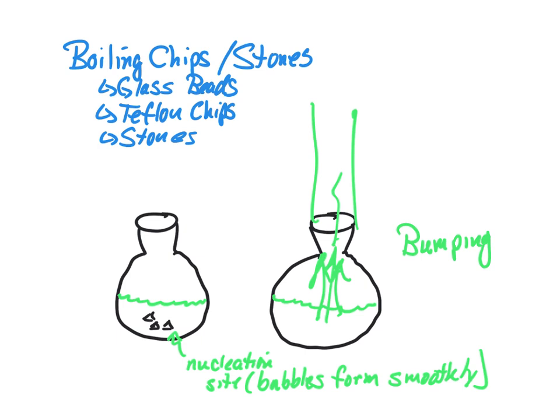Because what happens is these very pure liquids, especially non-polar liquids, can do something called superheating. That is, they can heat above their boiling point temperature without boiling. But then when they do boil, the whole mixture boils at once. And so it explodes.